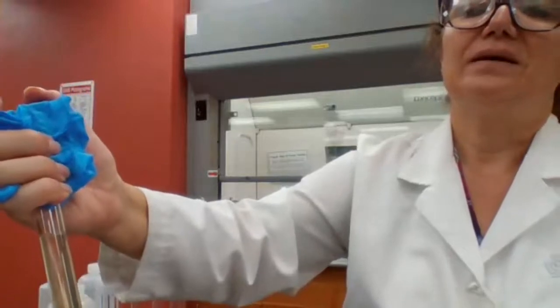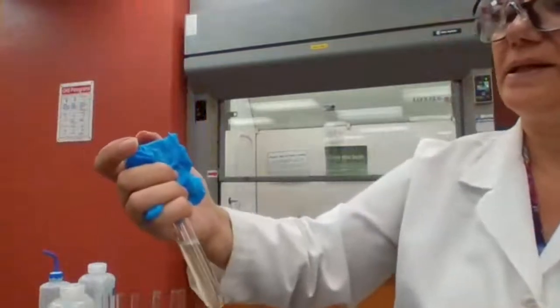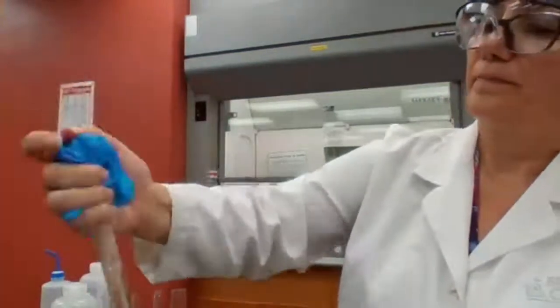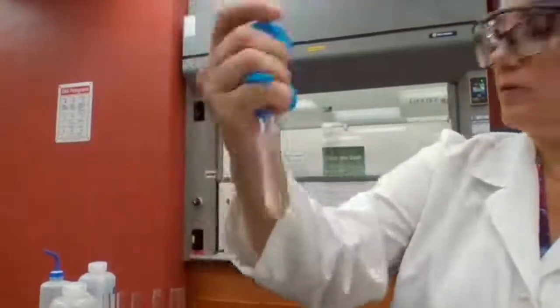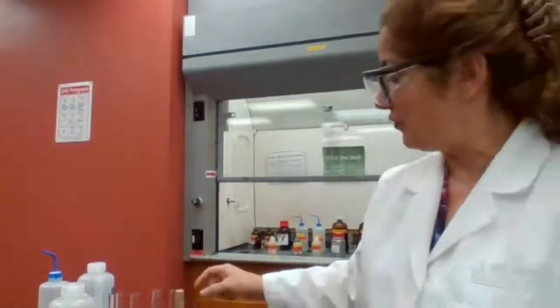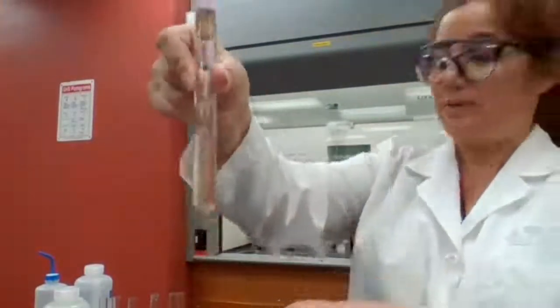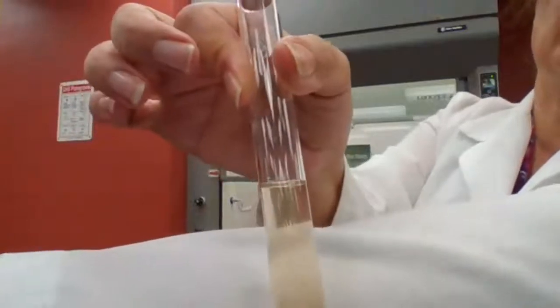If it stays a precipitate, it's the carboxylic acid. It's not the most reliable. For some of the acids, it did not work in the past. And if you go back to the beginning of the recording, I had this problem before also. It didn't always work. It turns cloudy, and then it stays there. I don't see a precipitate now at all after adding HNO3. It was supposed to form a precipitate.